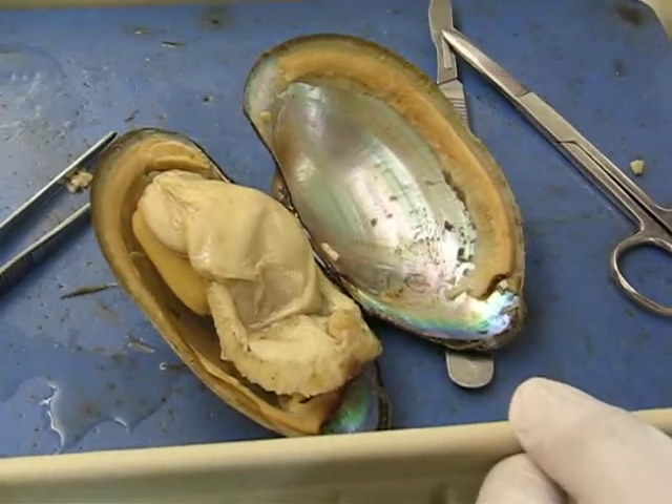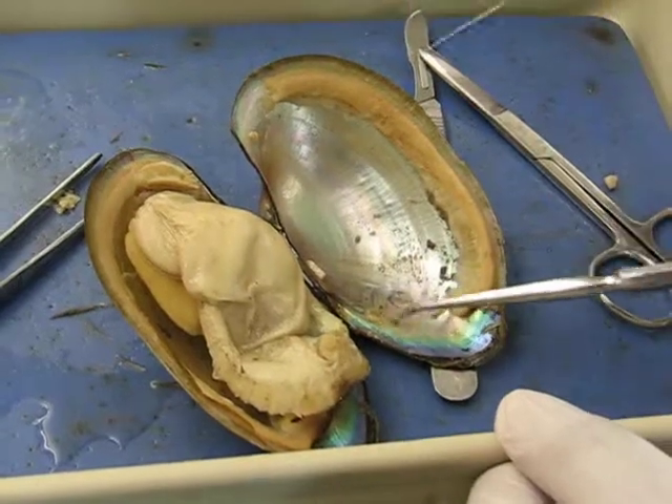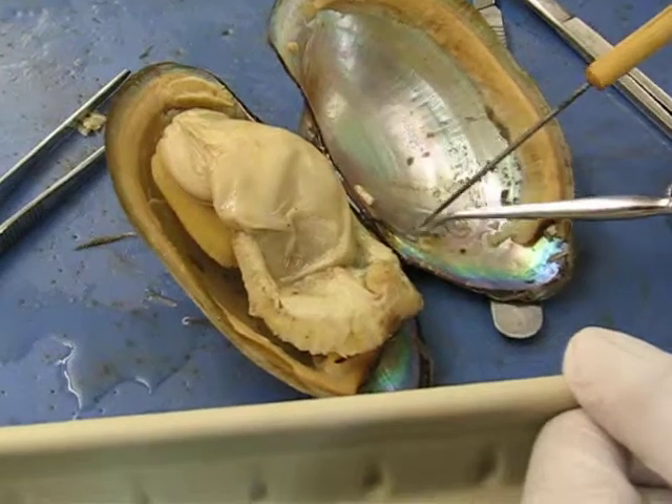The posterior adductor muscle scar — it's over here. Very good, the big one. And the posterior retractor muscle scar — it's above it.